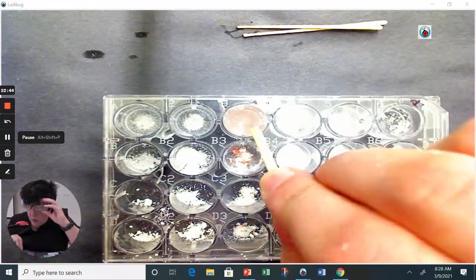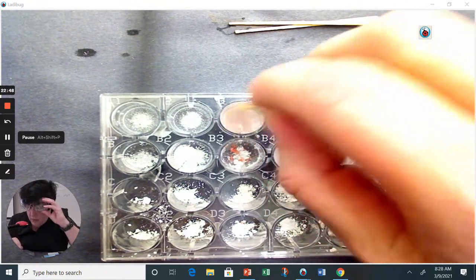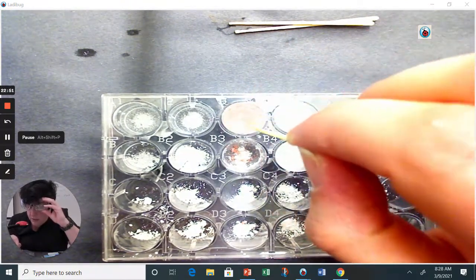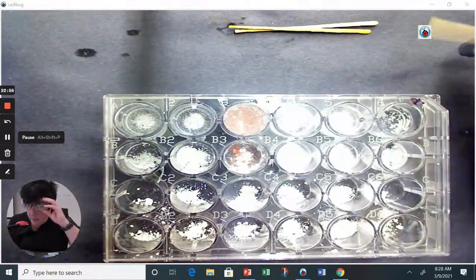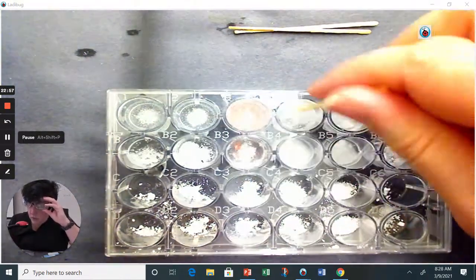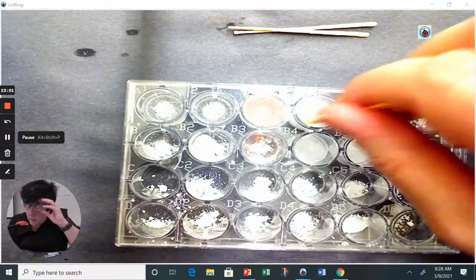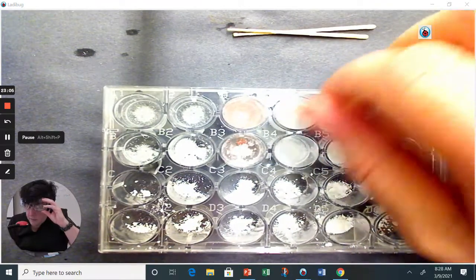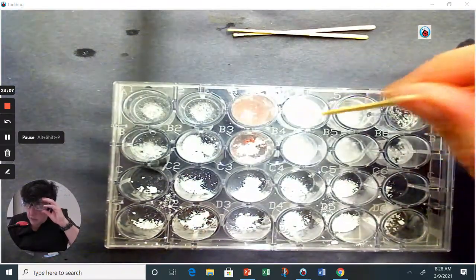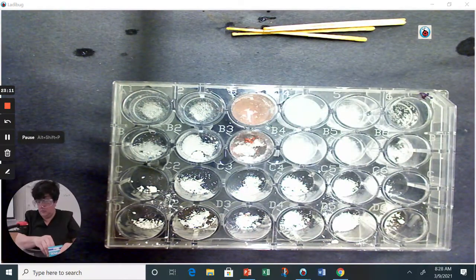The little colored pieces floated and then dissolved, but the actual white part of the drug is floating on the top. These sink to the bottom, that floats on the top. Okay, flip these over. This is slightly soluble. It's cloudy. And it's still bubbling. Interesting.